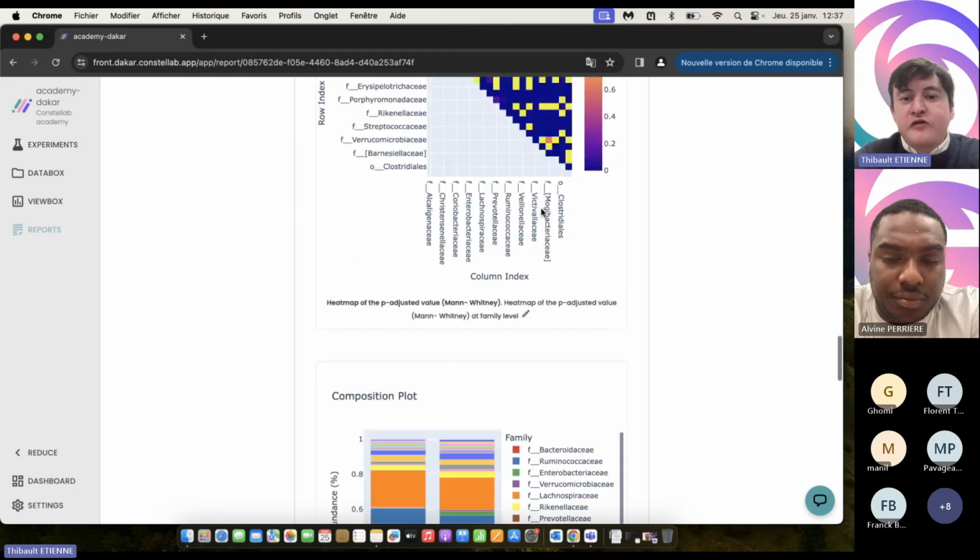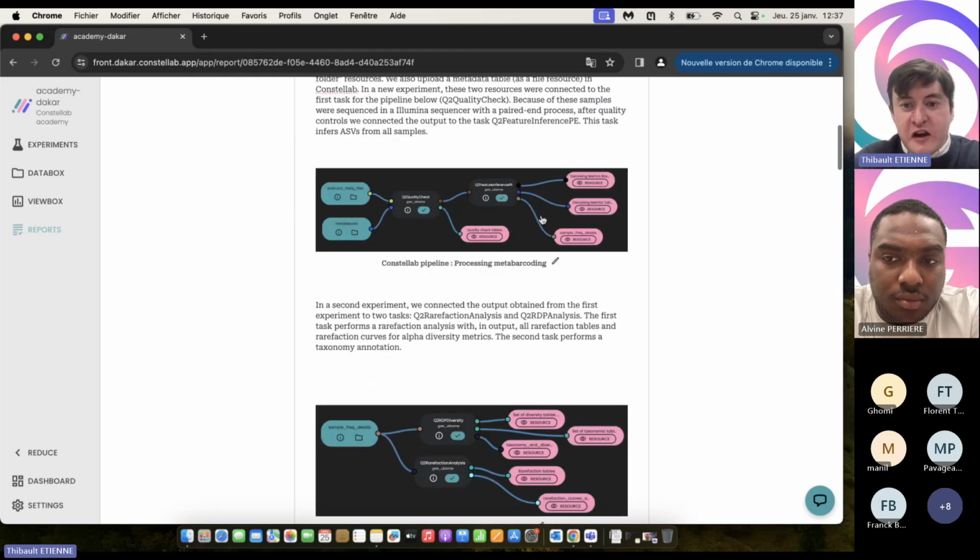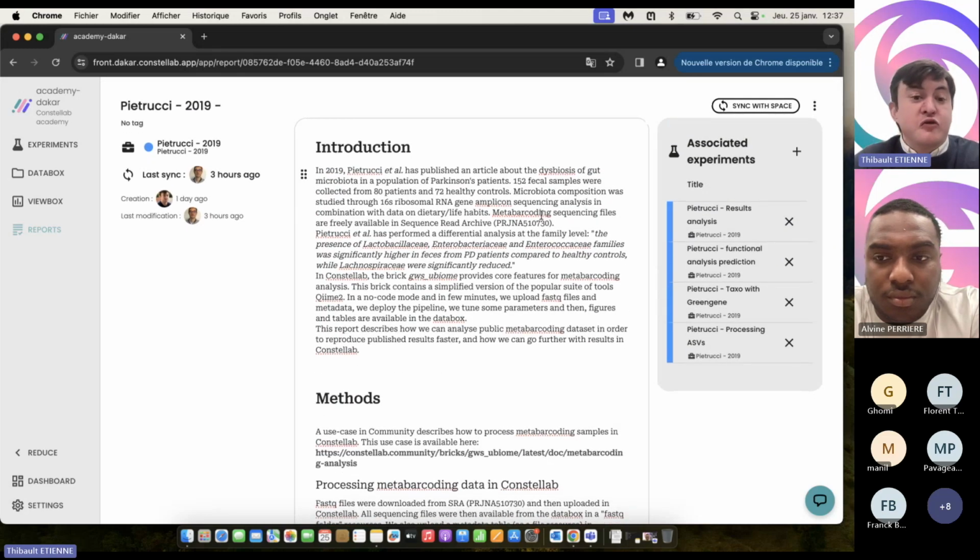The nice idea of this report is you can share it. For example, you can share this report directly with colleagues without the experiments or the technical part. So it can be useful, for example, to share the report between different teams in your company.